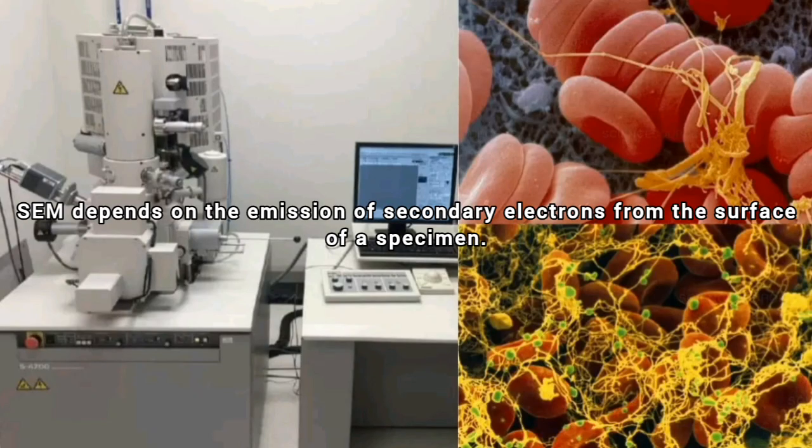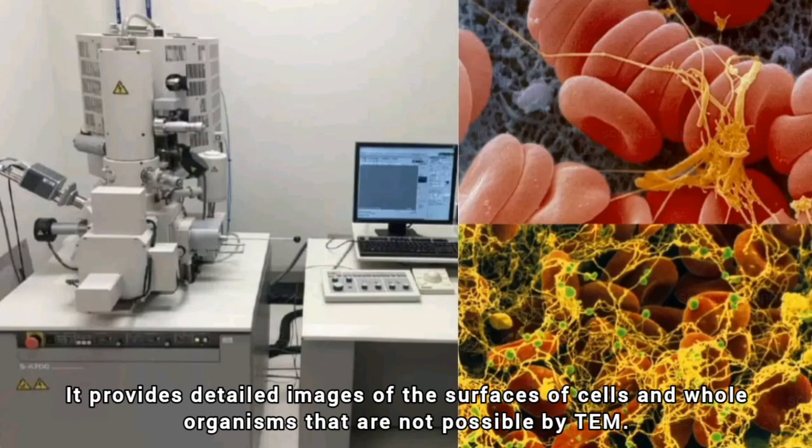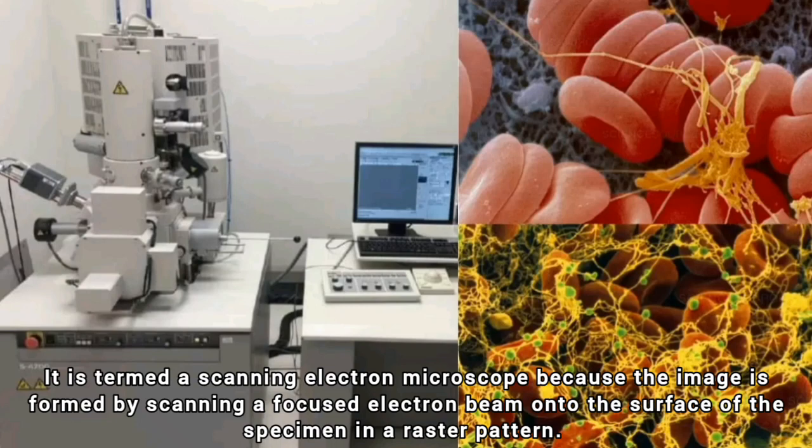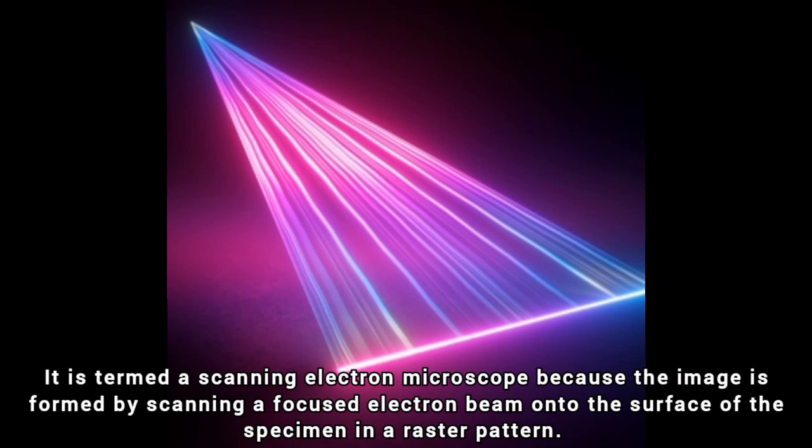Scanning electron microscope depends on the emission of secondary electrons from the surface of a specimen. It provides detailed images of the surfaces of cells and whole organisms that are not possible by transmission electron microscope. It can also be used for particle counting and size determination, and for process control. It is termed a scanning electron microscope because the image is formed by scanning a focused electron beam onto the surface of the specimen in a raster pattern.